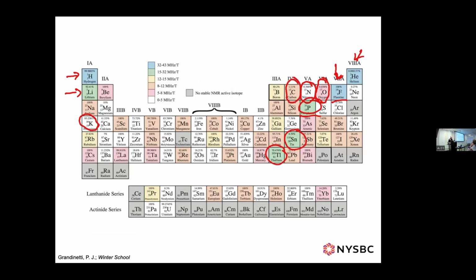I had posited the question: why are the quadrupole coupling tensors almost identical for all these different water molecules in different single crystalline amino acids? Why is that interesting? Why is that something you'd expect to see? They all have exactly the same electric field gradient.